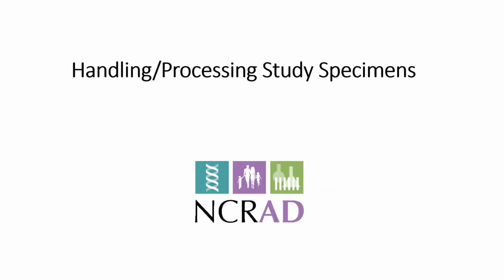Hi everyone, I'm Maddie, and I'll be going over the handling and processing of study specimens, and at the end of the PowerPoint I'll also be going over shipping and the sample notification forms.